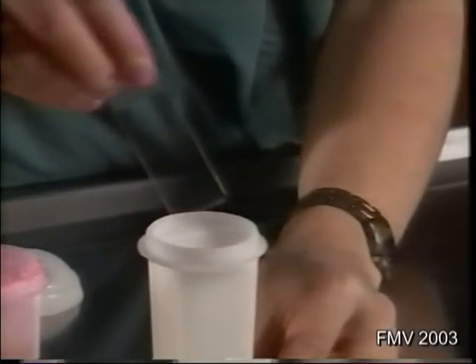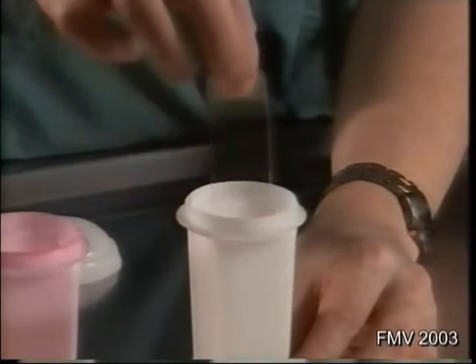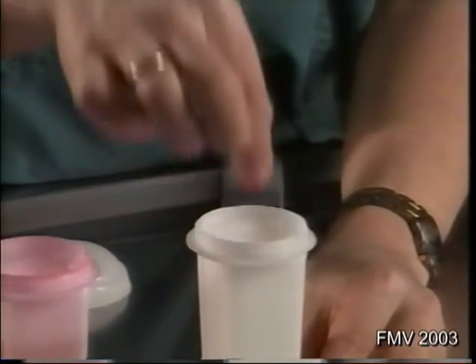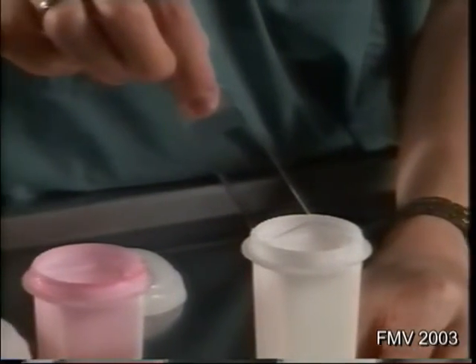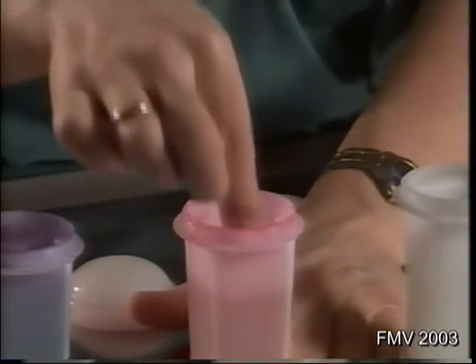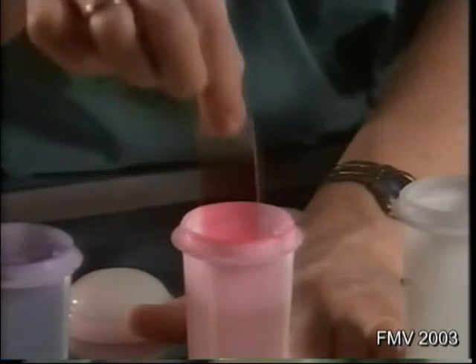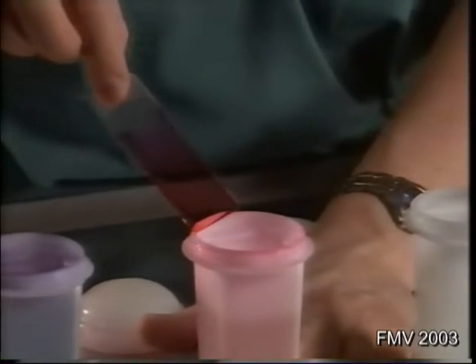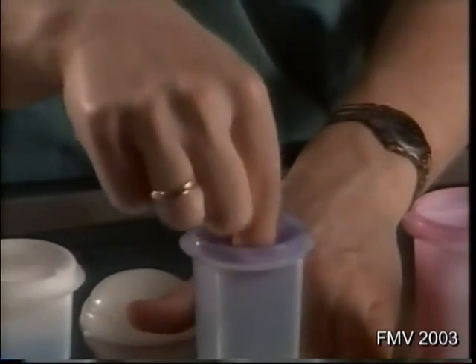Soak the slide in methanol, soak in the orange stain solution, and soak in the blue stain solution.